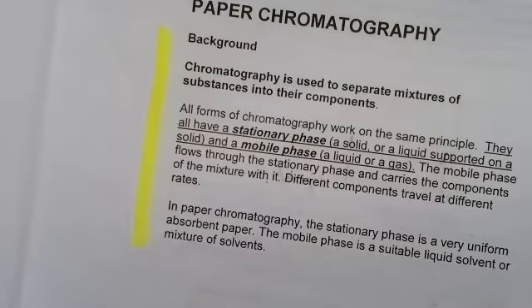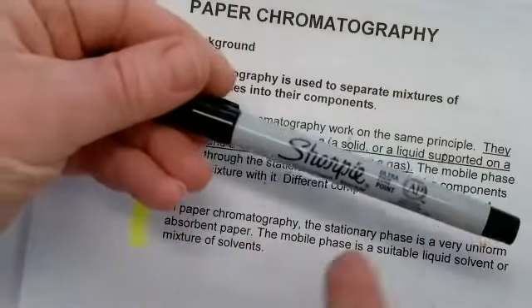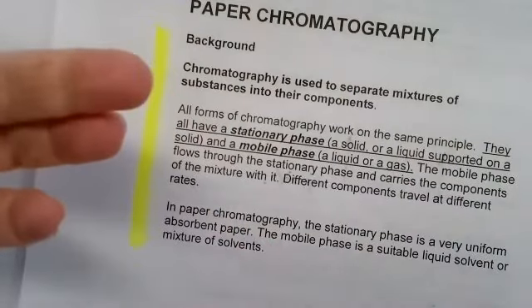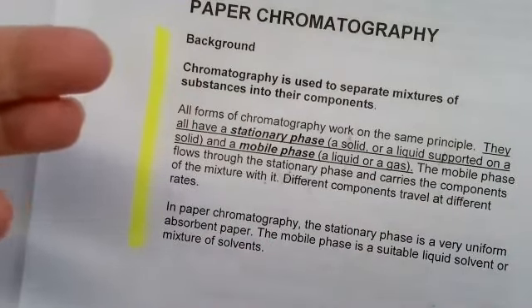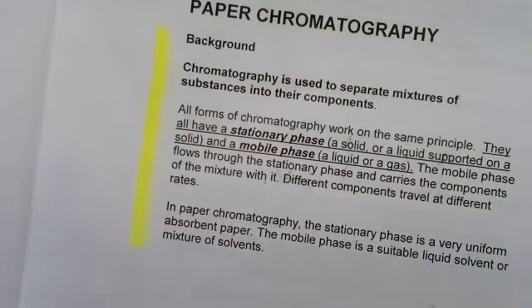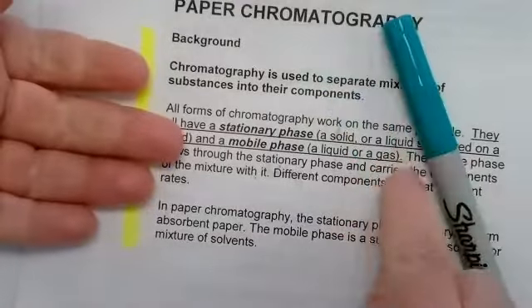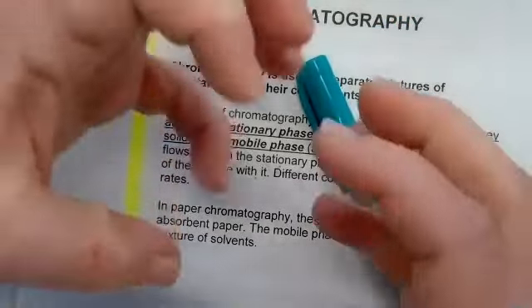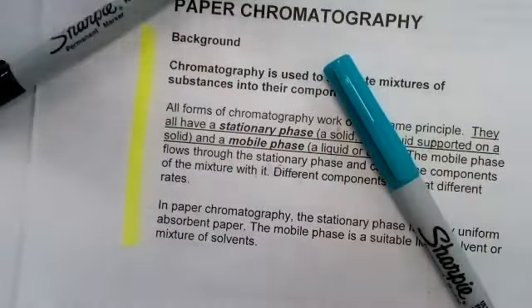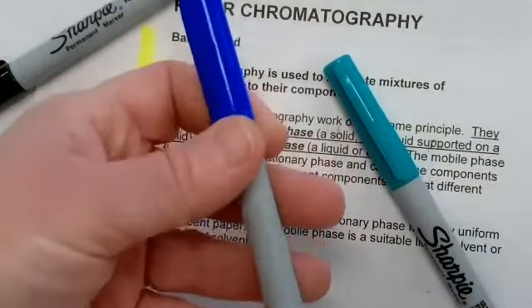But not all mixtures are that easy to separate. That's what we're going to be faced with today. So for example, Sharpie. How does Sharpie make the black ink? Does it combine different colors? Or is there a black specific molecule? Or how about this shade of green? Is this an individual color molecule? Or did Sharpie combine a little bit of maybe blue with a whole lot of yellow and so on?